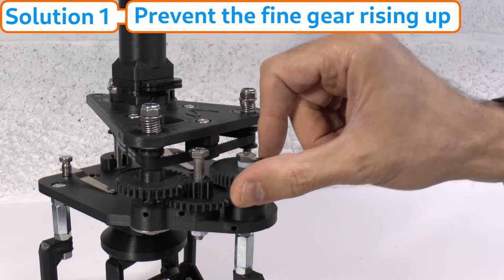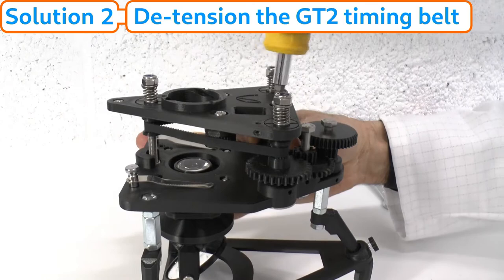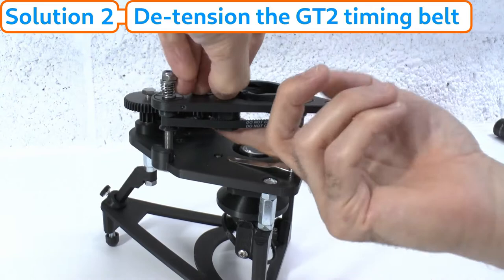Another cause of difficulty in moving the focus gear is if the GT2 timing belt is too tight. The eccentric belt tensioners should all be at their minimum setting on a new Z-stage. If that is still too tight you can try removing them completely. If you only want to remove one, that should be the back one to keep a symmetrical system; if removing the back tensioner is not sufficient, then remove them all.